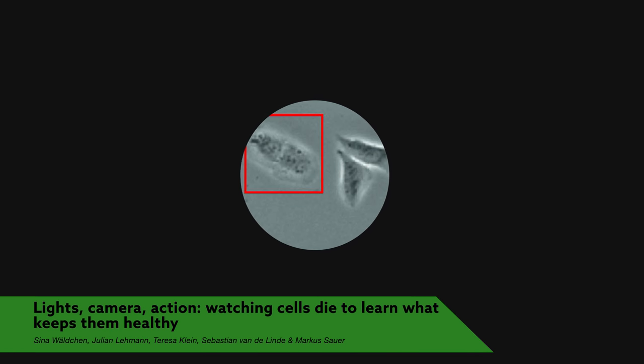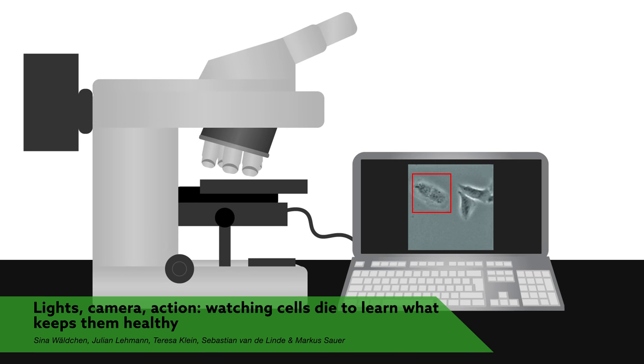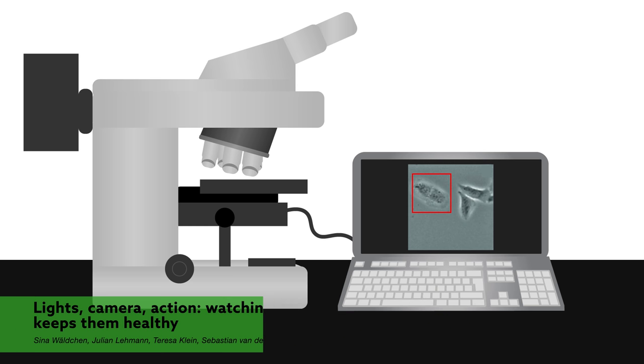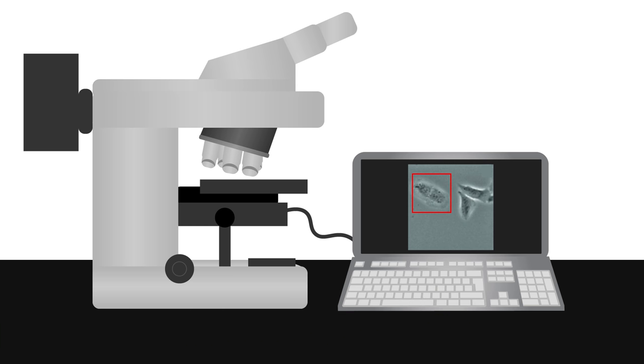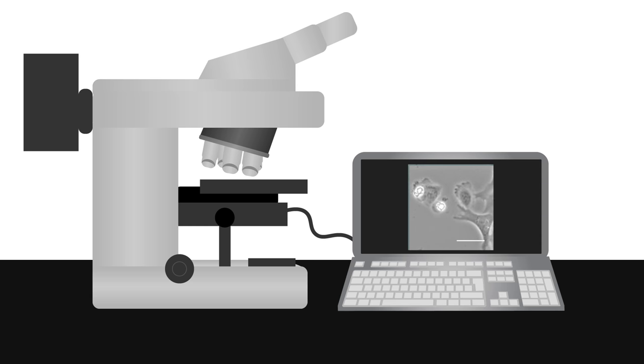Can you tell whether these cells are healthy or will soon die? For years, scientists performing fluorescence microscopy experiments assumed cells like these were healthy. But researchers from Germany report that many of these seemingly healthy cells are in the process of dying.